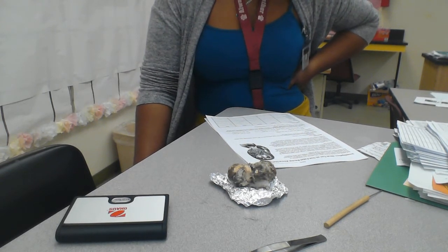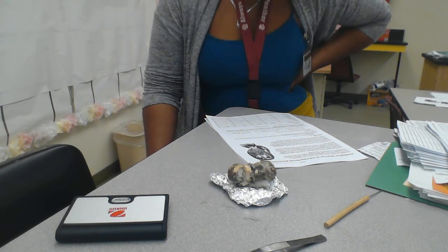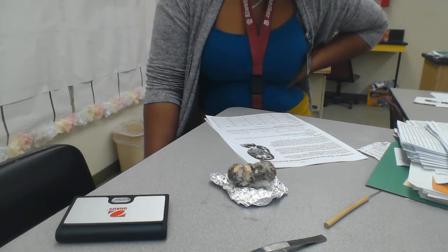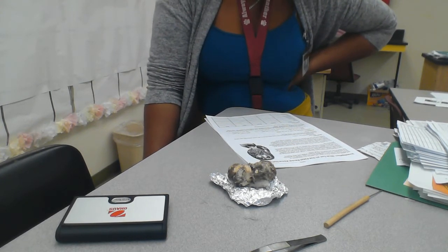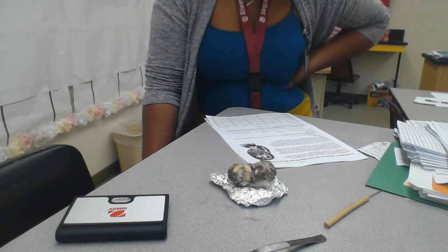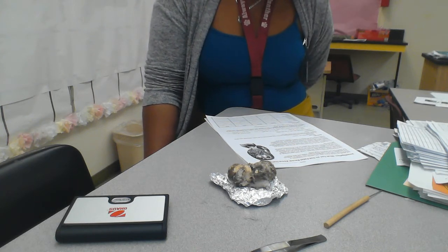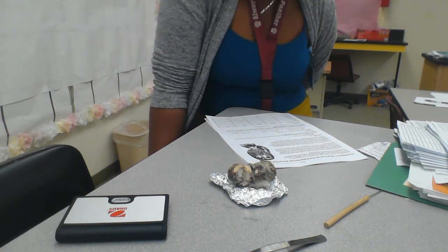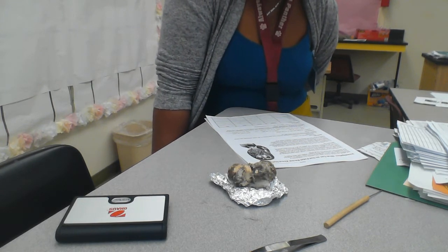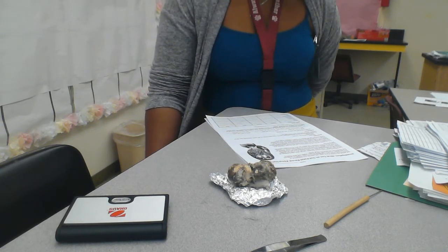barns. Owl pellets themselves are ecosystems. This is a very important part because there's a question about this. Owl pellets themselves are ecosystems. Owl pellets provide food and shelter for communities of clothes moths, carpet beetles, and fungi. Clothes moths are frequently abundant in pellets, feeding on furs and feathers. The black specks, which are about the size of periods, are the droppings of clothes moth caterpillars. The caterpillars metamorphose near the surface of the pellet in cocoons made of fur. All right? So that's that.